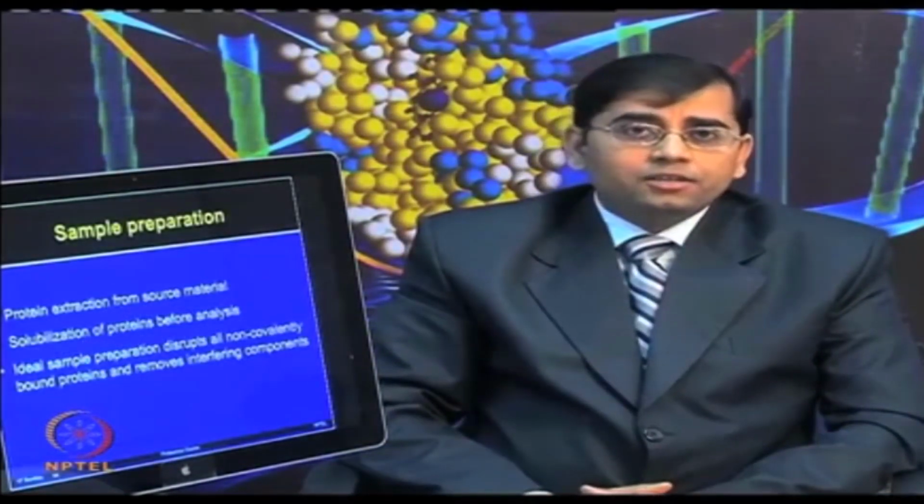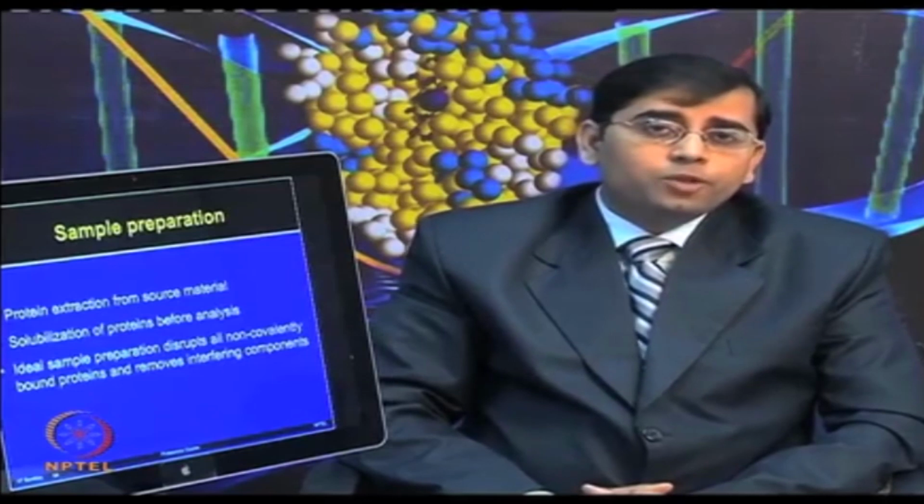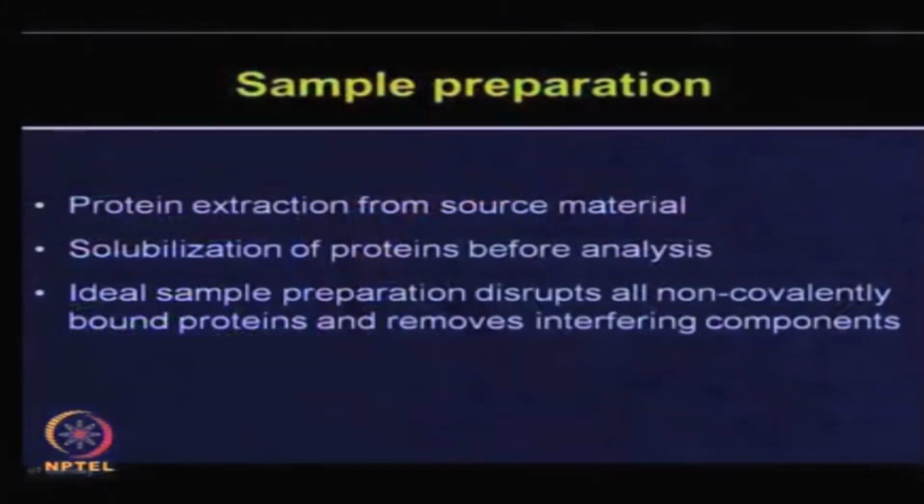Sample preparation. The protein extraction should be performed from source material, and then you need to solubilize the proteins before starting analysis. The ideal sample will disrupt all the non-covalent bonds present with the proteins, and it will remove other interfering compounds.